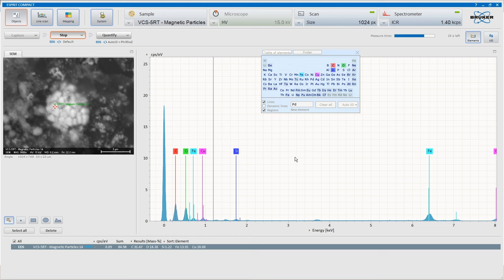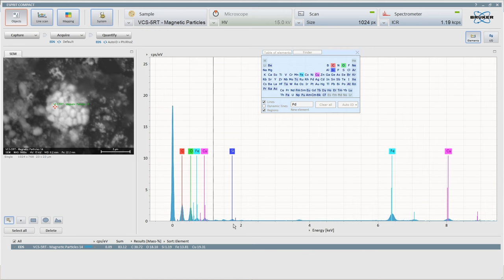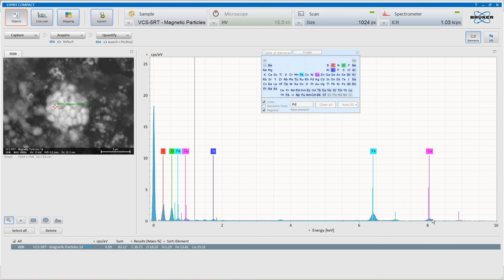Question is, why is it magnetic? Well, it has some iron in there. Is it being swept up with all the other magnetic materials, possibly? That is that. Fair chunk of copper in there. Yeah, it's definitely got copper. It's got the secondary peaks there. Okay.